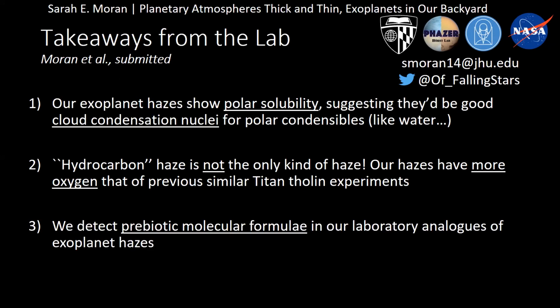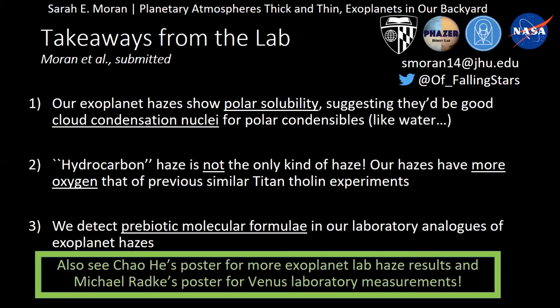And finally, we detect some very interesting formulas in our data from the mass spec of these hazes. And I didn't say before, but these are very much formula detections, because we're not able to resolve structure with these mass spec measurements, and so we're going to have to do some follow-up work to ensure that those are actually the molecules we're seeing instead of just a lucky formula that pops out of the data.